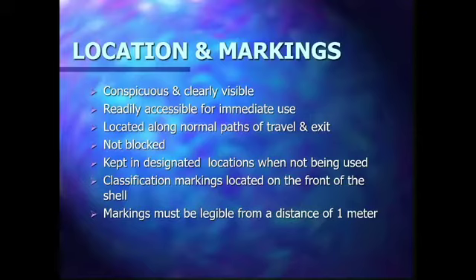The moment you walk down any corridor or any building, the marking for the fire extinguisher has to be very, very visible. Emergency does not wait for you to think and ask where the extinguishers are located. And fire extinguishers should be readily accessible for immediate use. It has to be in a state where it is ready to be used.